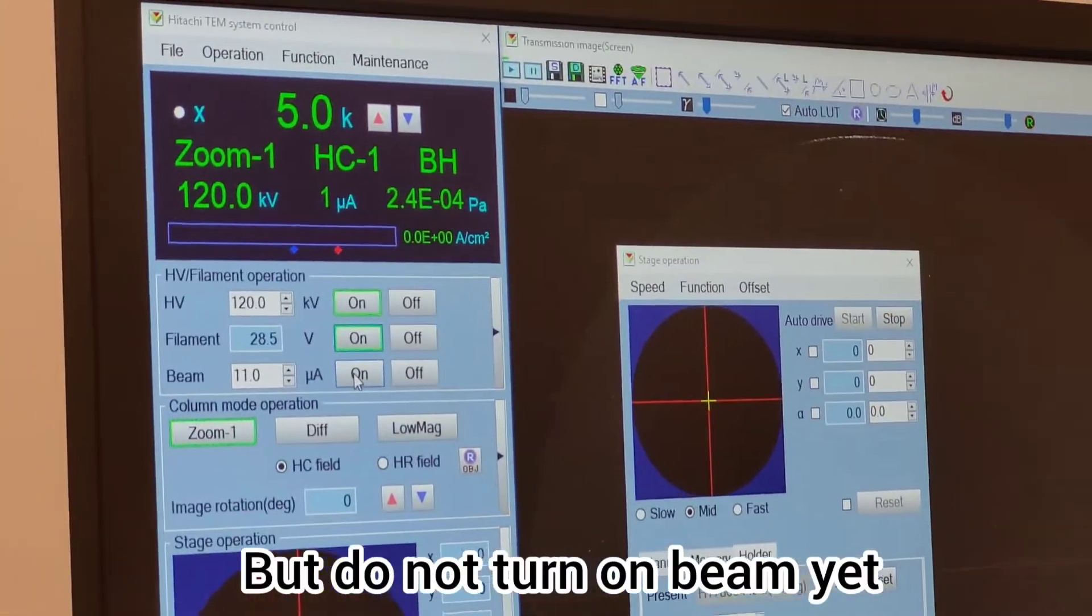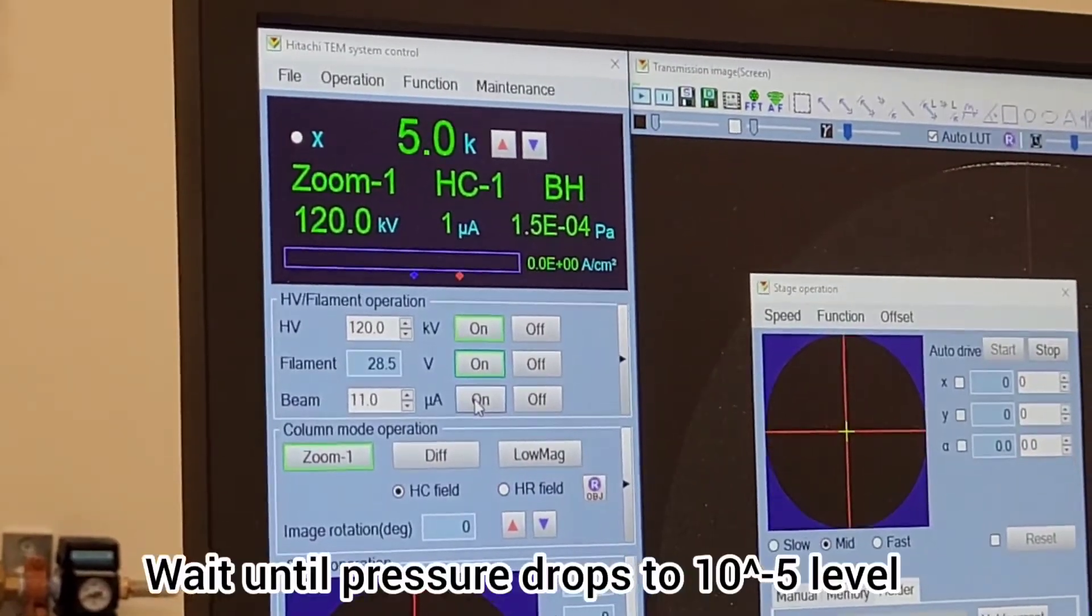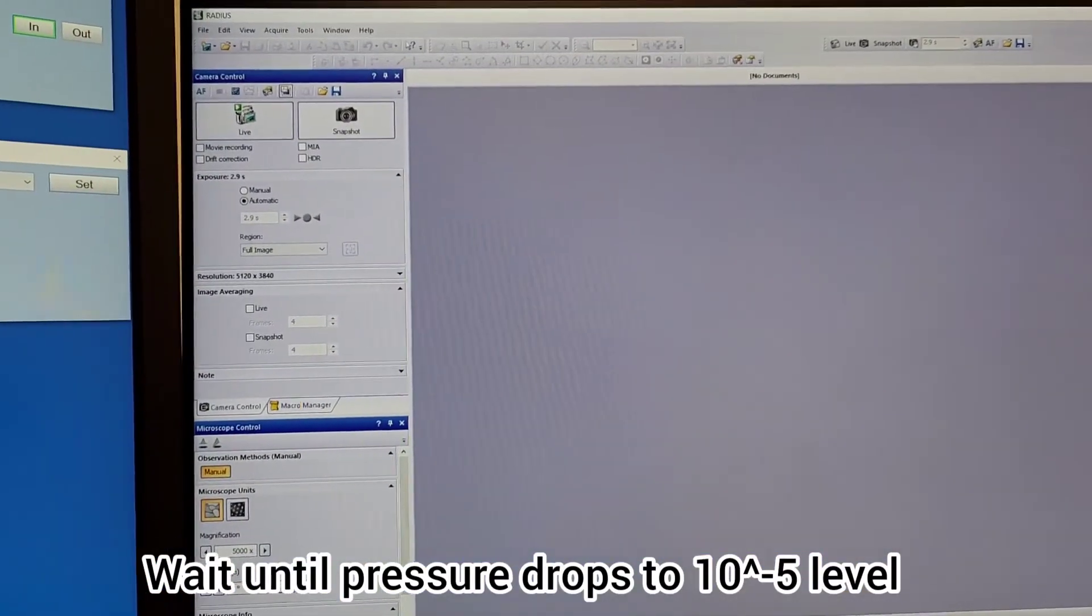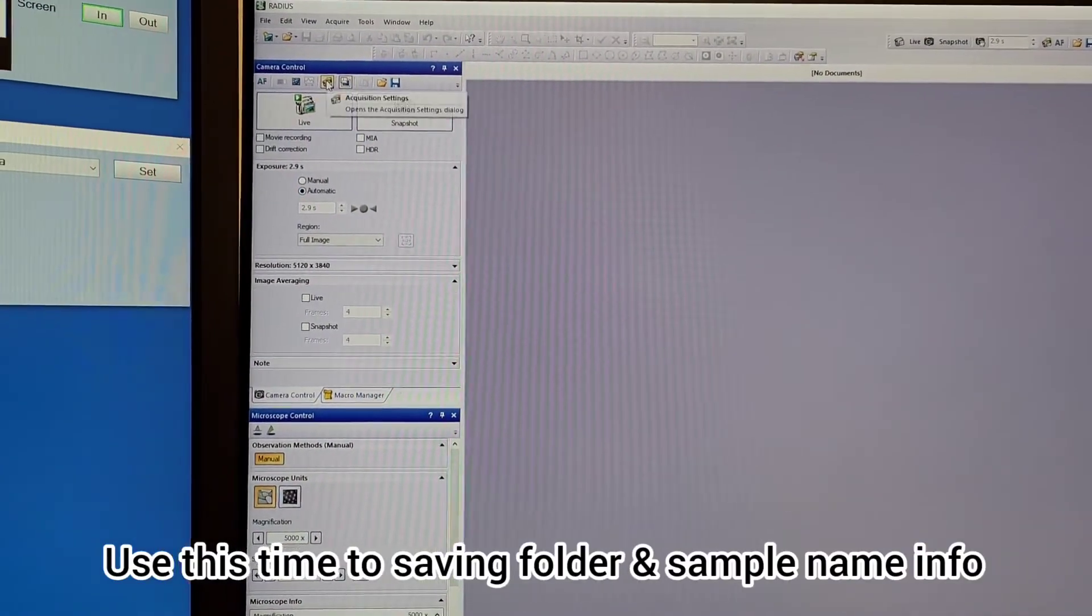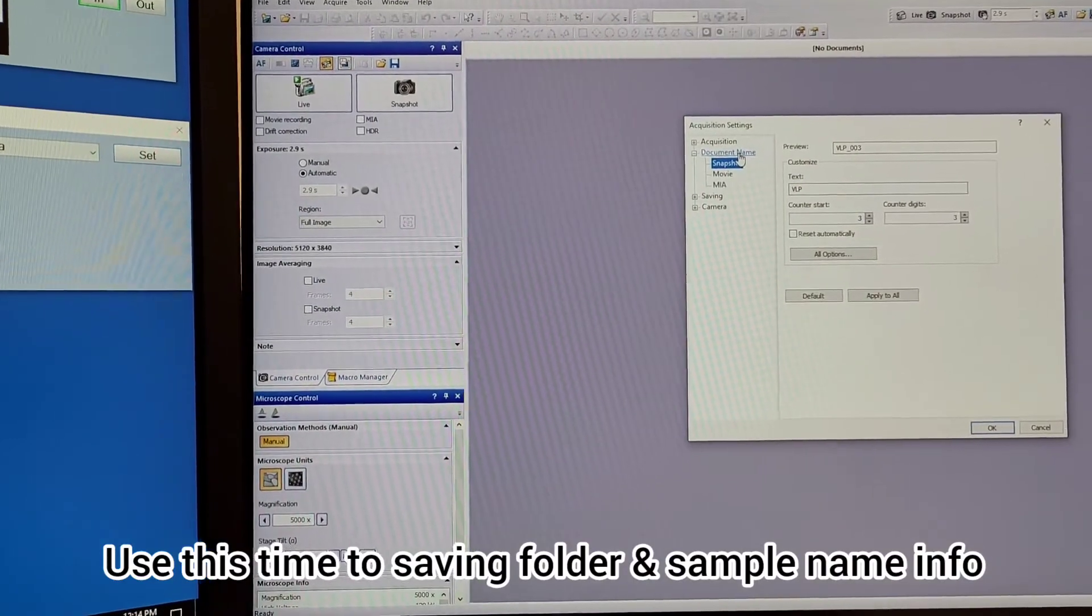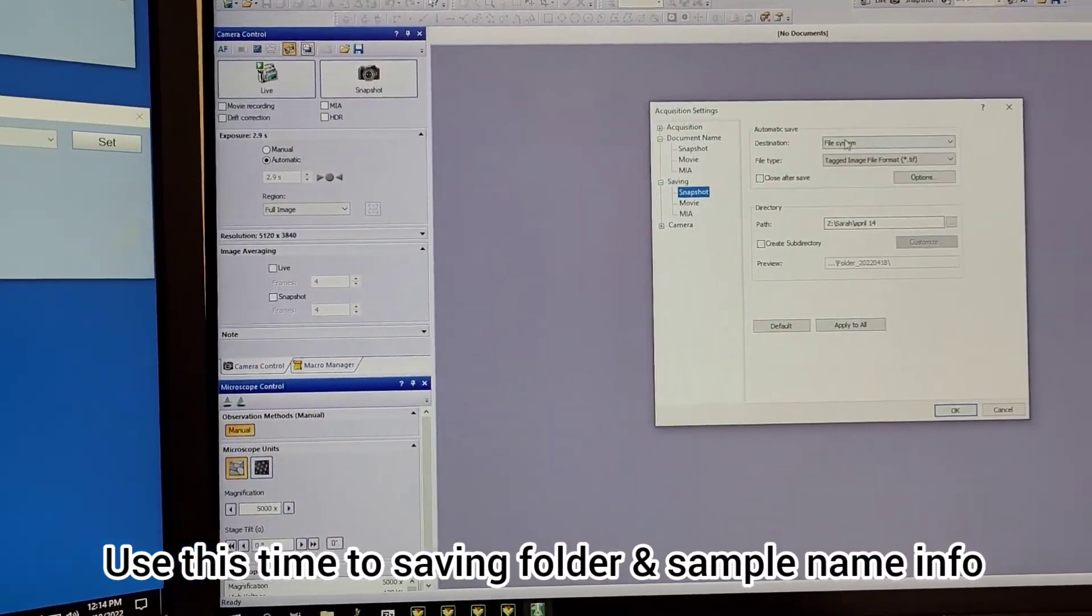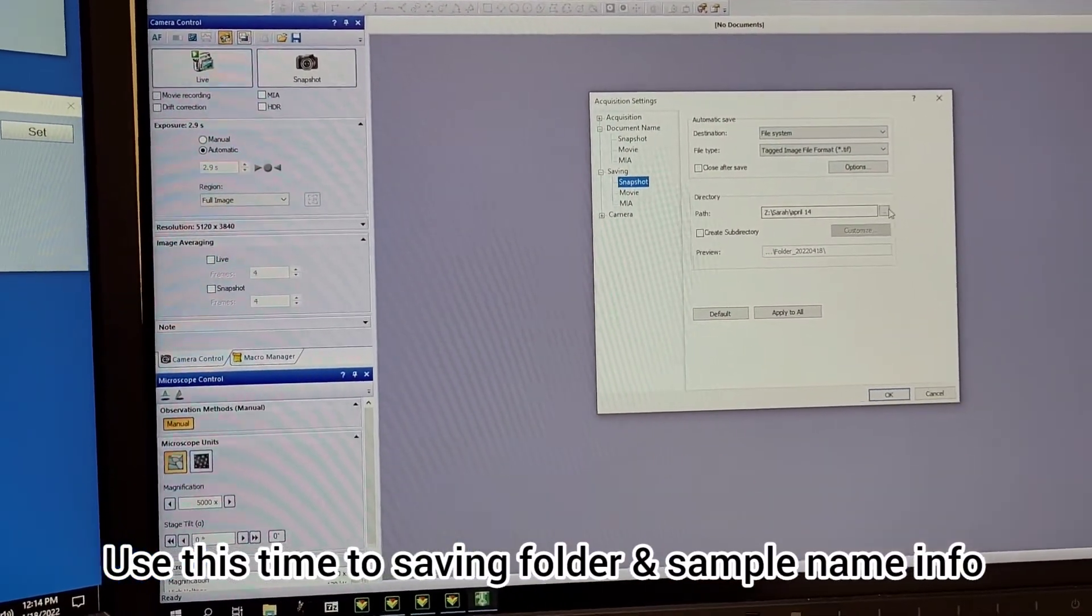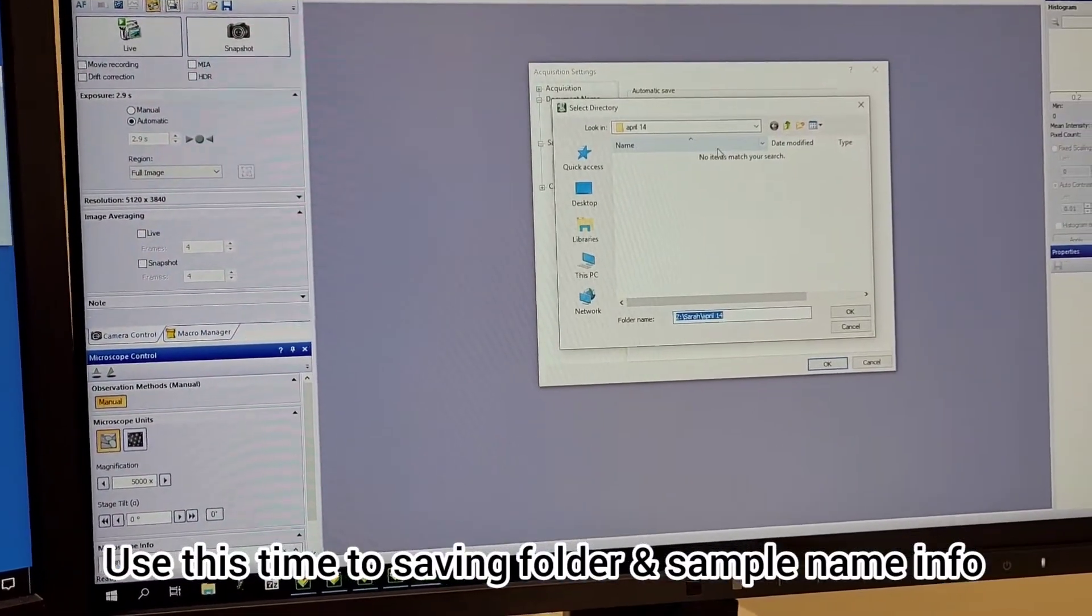After that you want to wait until the pressure drops. This will take a bit so meanwhile I will change the sample name and my settings for where I want to save the images.